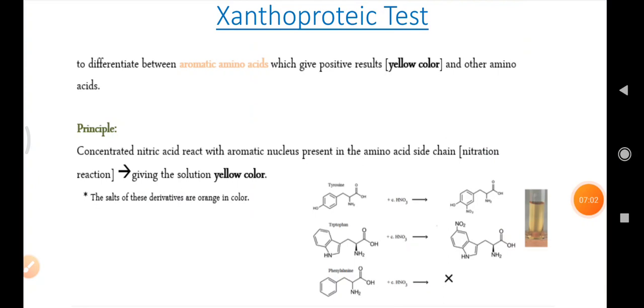This is the change in color which we can observe during performance of the practical. Now coming to the third test that is the xanthoprotic test. Xanthoprotic test is used to differentiate between aromatic amino acids which give positive results.